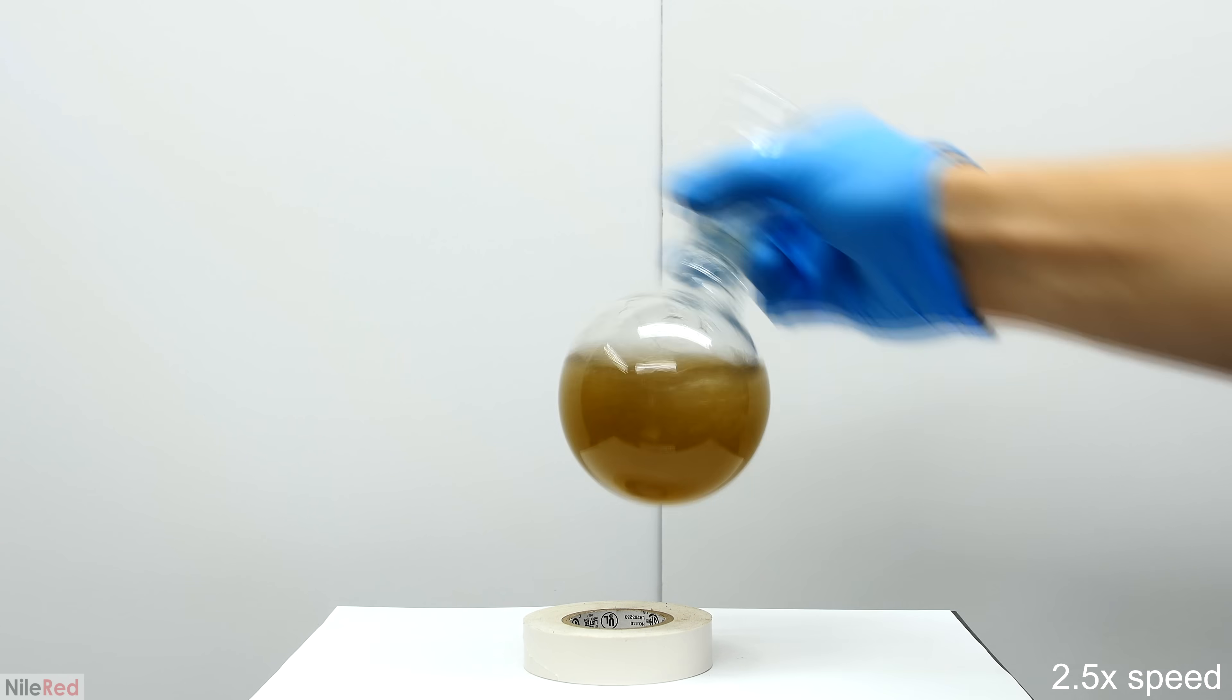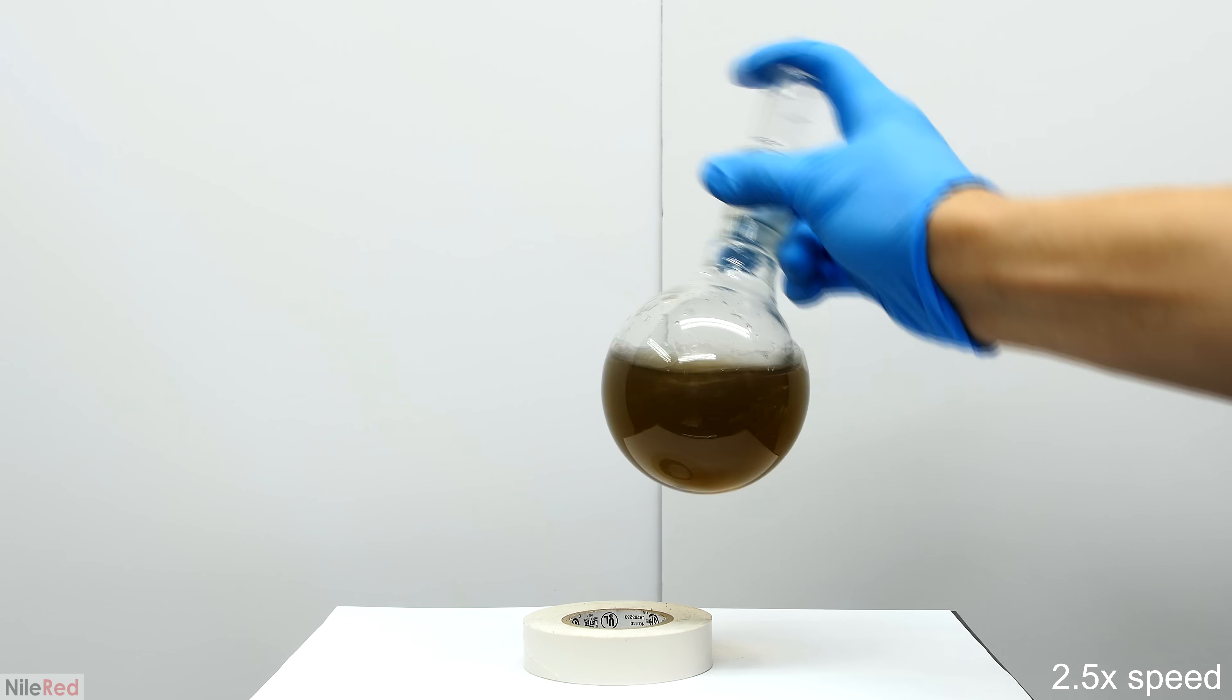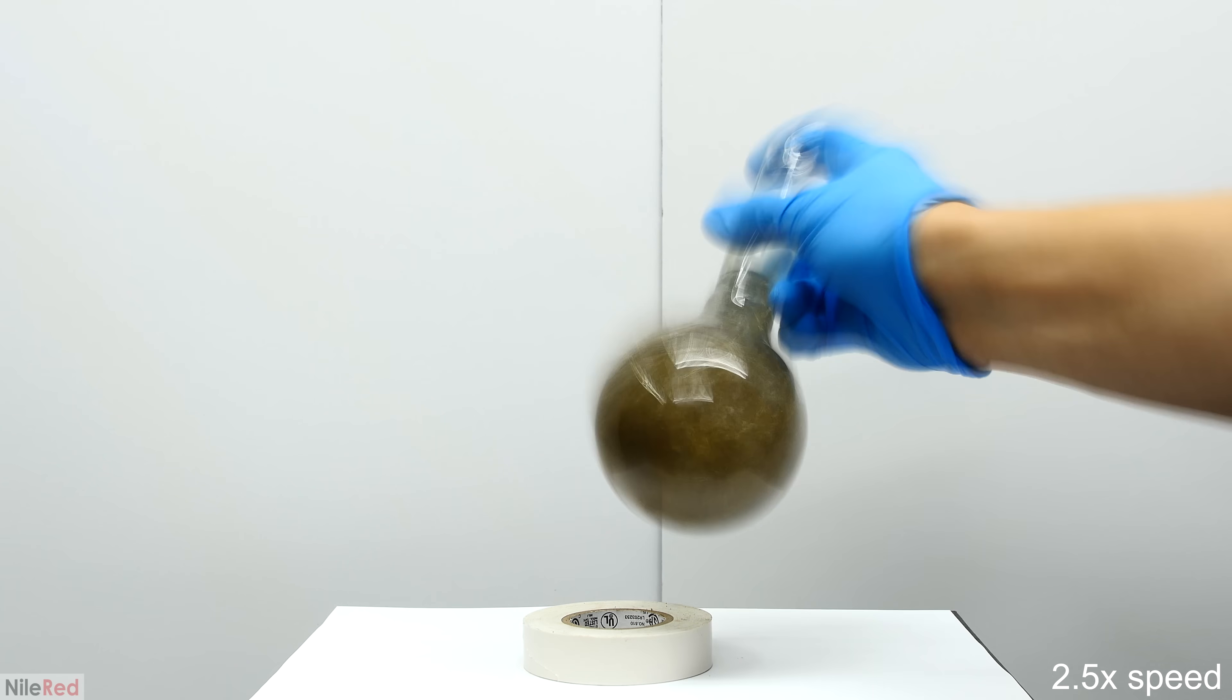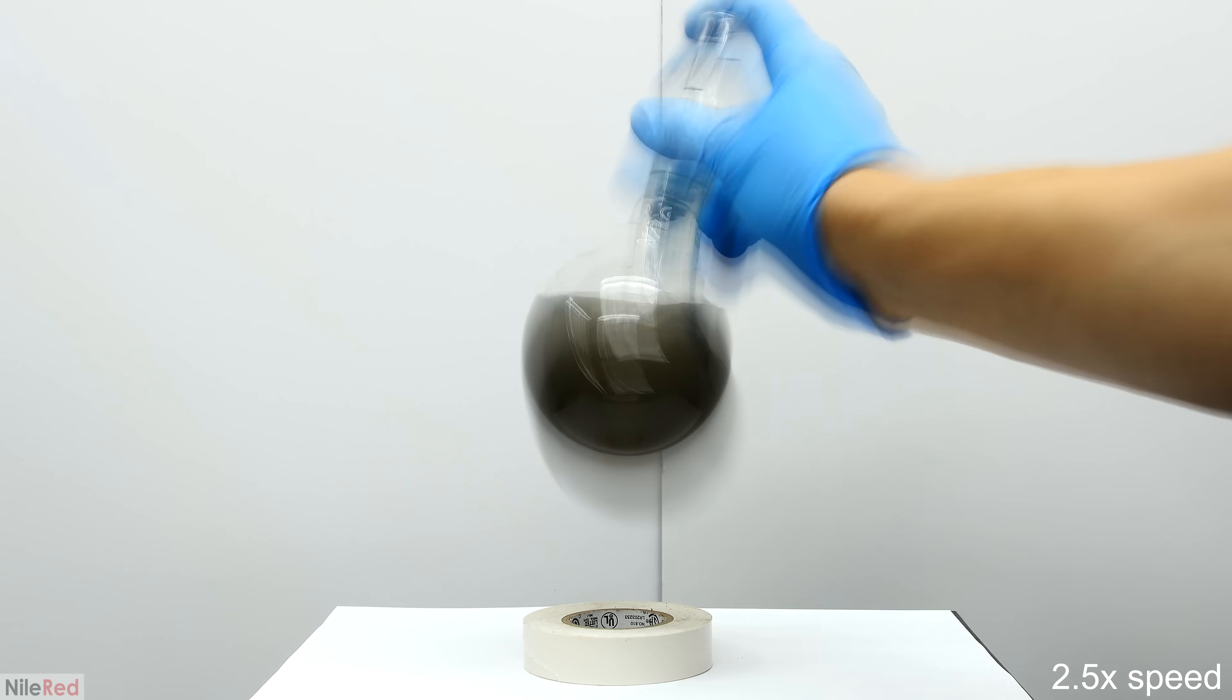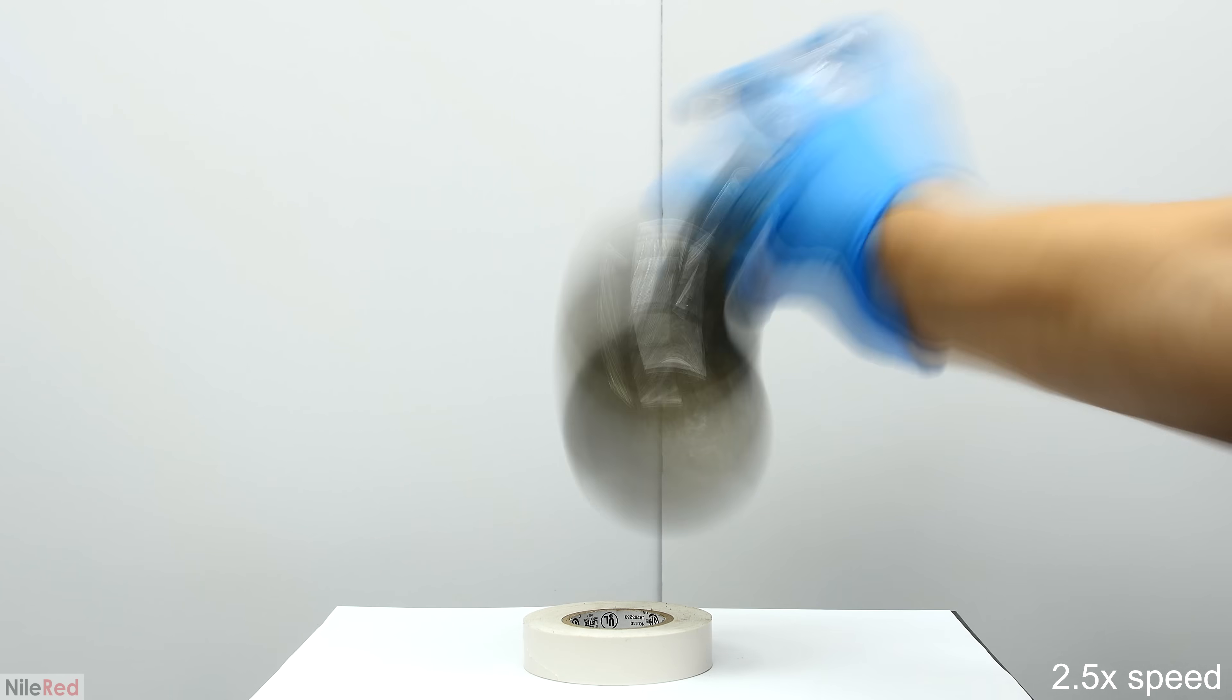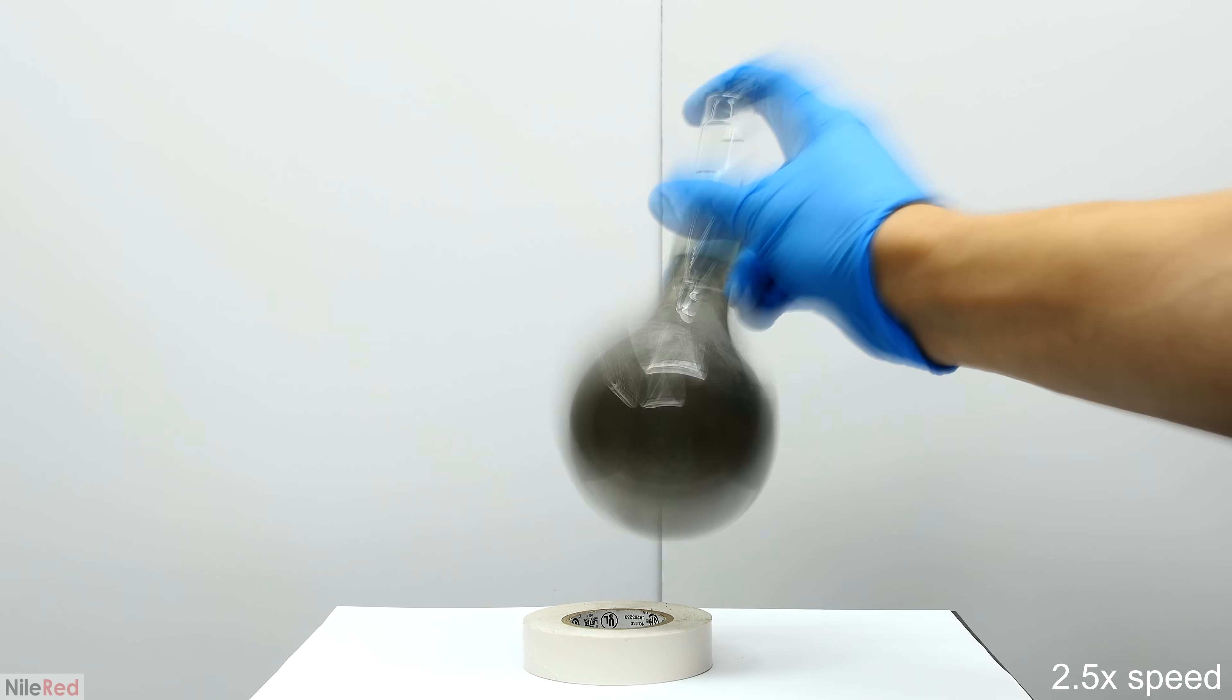Then very quickly, silver metal starts to precipitate out, and the solution becomes nearly black. As I continue to shake the flask, it will appear to be more and more reflective, until eventually, it's very clear that a silver mirror is forming.